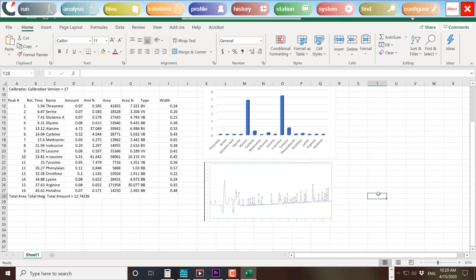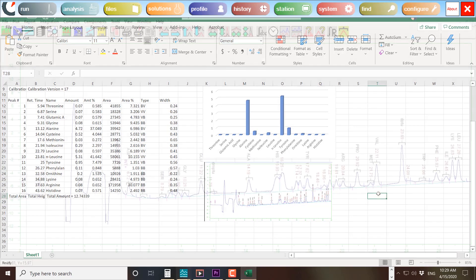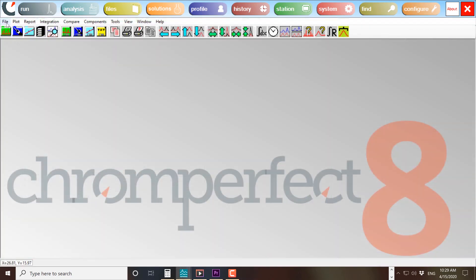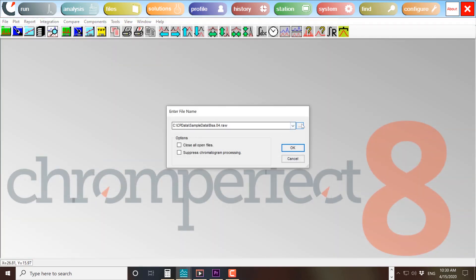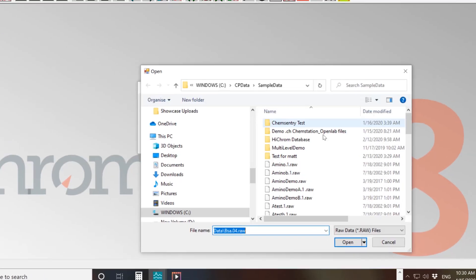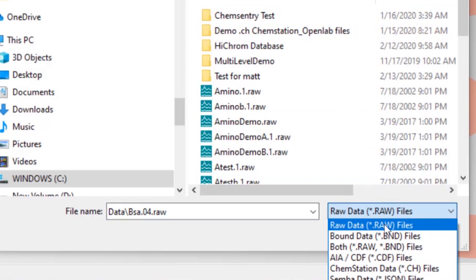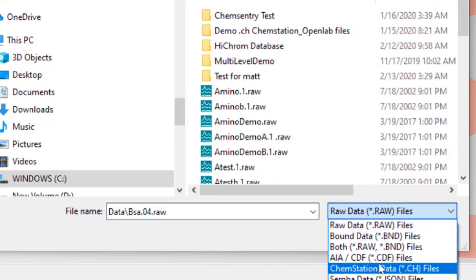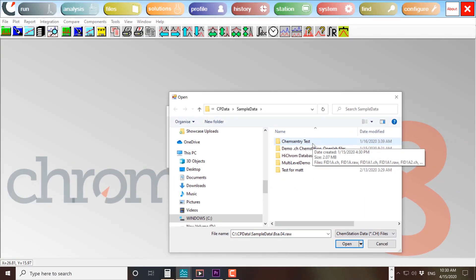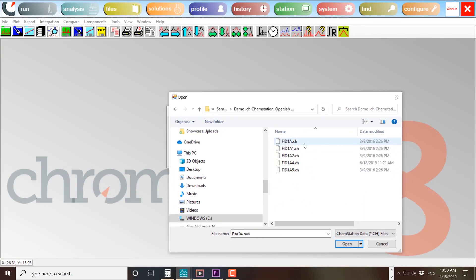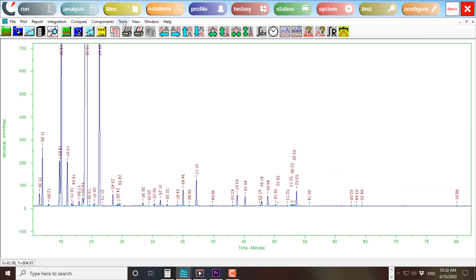Do you have ChemStation or OpenLab data files? You can open them directly in ChromePerfect. No file conversion. No messing about. Simply file, open, select ChemStation. And boom.